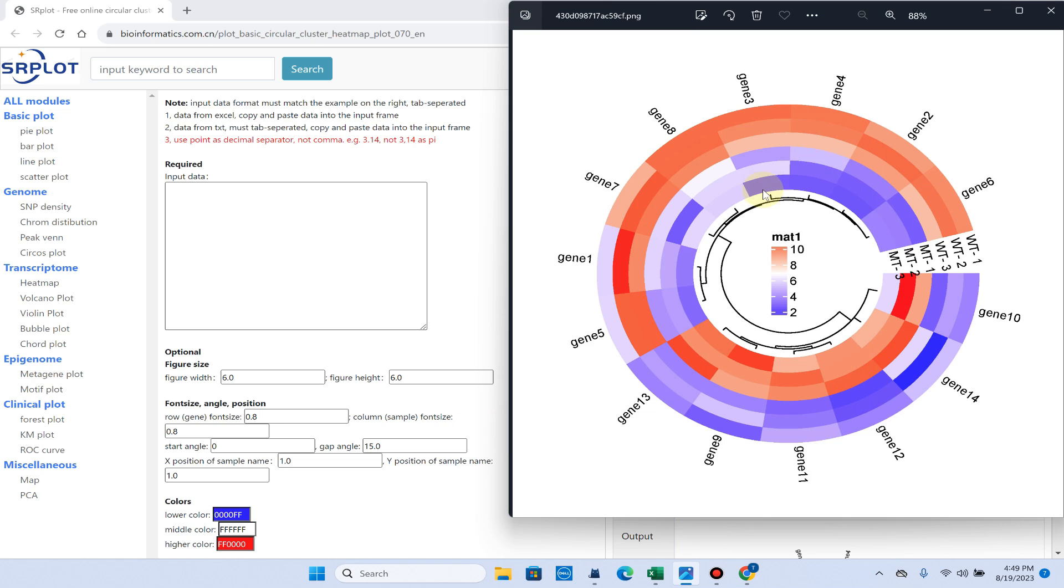Welcome to another video tutorial. In this video, I will show you how we can draw a circular heat map using the SRplot website.